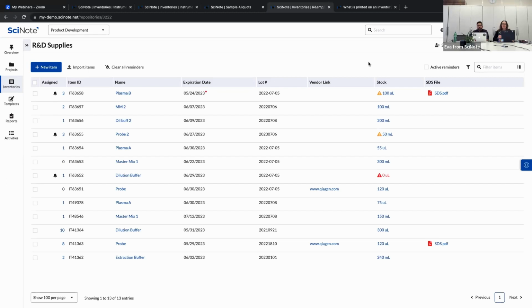And you can also track how much of a particular item was consumed over time in the audit trail at the moment. And of course, for the future, we do have a feature planned that will allow you to see a usage summary of a particular item or items, so you can see how much of that item you've used within a period of 6 months or within a particular project, or within different other conditions as well.